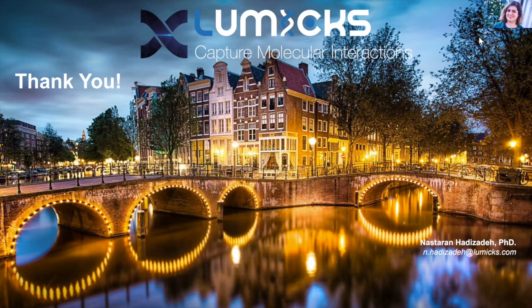Well, as I showed, maybe I can show the system again. You can close the system, but at the same time, you do want to clean up if there is any spill on the system. I don't know if that was what they asked or not, but the examples that I showed you here are not actually viruses. They act like virus particles, so they're not dangerous or pathogenic. But in terms of how closed the system is, I'll show you how the system looks again.